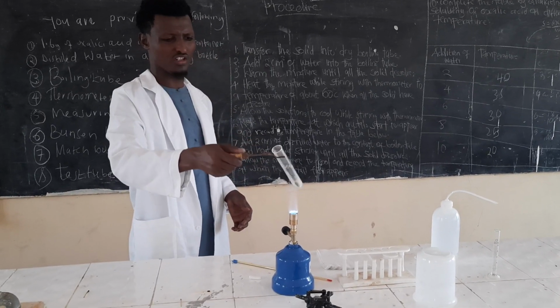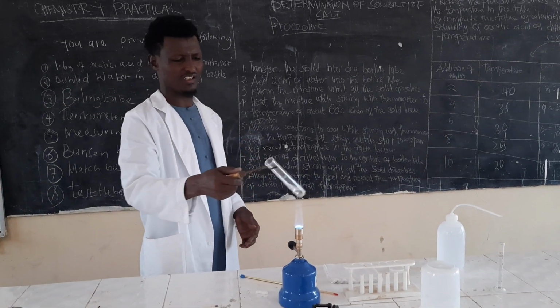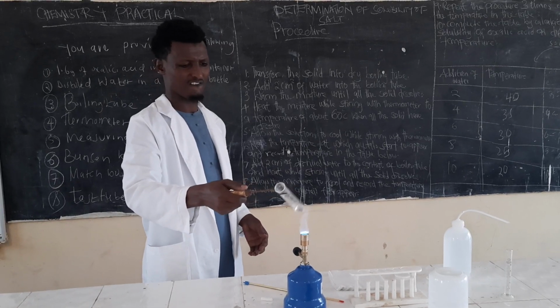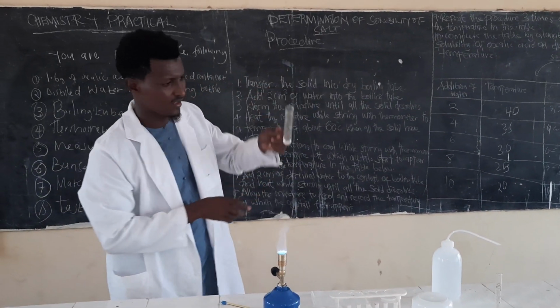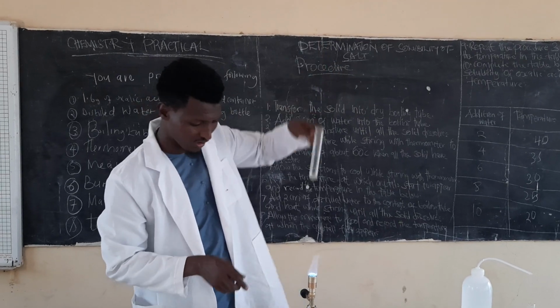I'm warming the solid until it dissolves. Yes, the solid has dissolved.